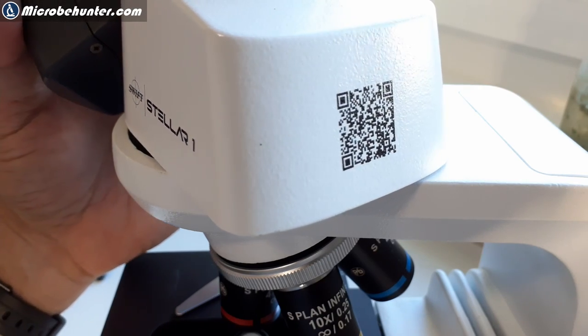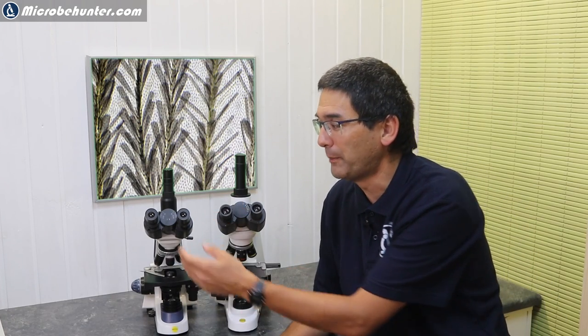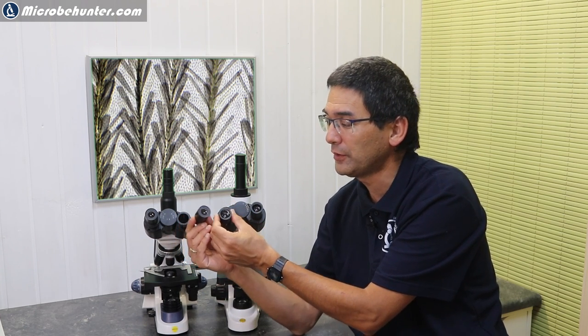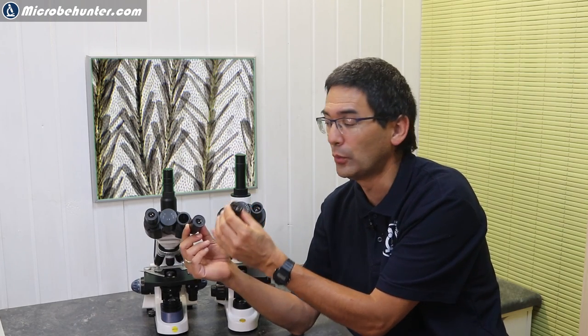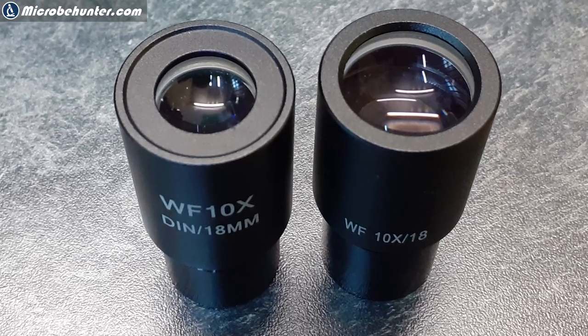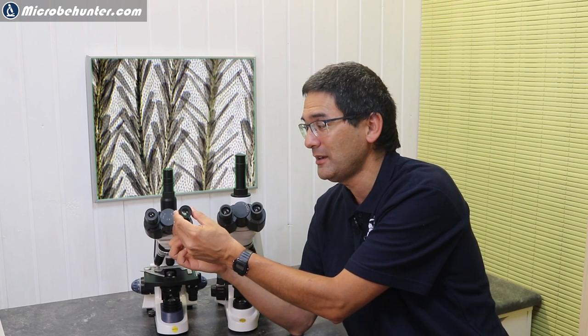So now let's have a look at the eyepieces of those two microscopes. Both of them have 10x eyepieces connected, but if you take them out and compare them, you're going to see that the Stellar One eyepiece front lens here is significantly larger than the one of the 380T. What is the difference? The difference is that the Stellar One actually has eyepieces with a larger eye relief, so-called eye relief.